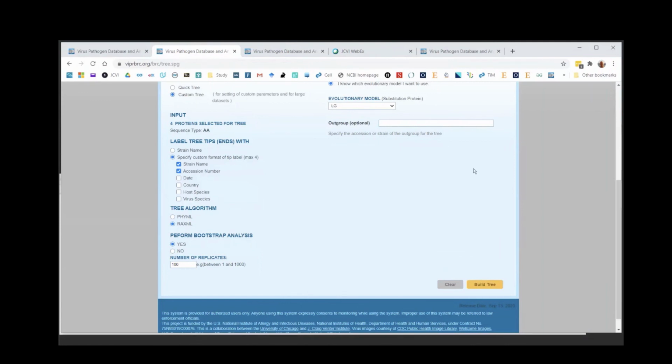Okay, so I am a bioinformatician at the National Institute of Health, NIH, Islamabad, Pakistan, at the virology department, and we are sequencing SARS-CoV-2 via iSeq 100 and MiSeq. So my question is, previously, 2 weeks ago, I used ViPR, the special one inside ViPR, where you browse the annotation, assembly, and SNP analysis, which takes you to the PATRIC browser as well.